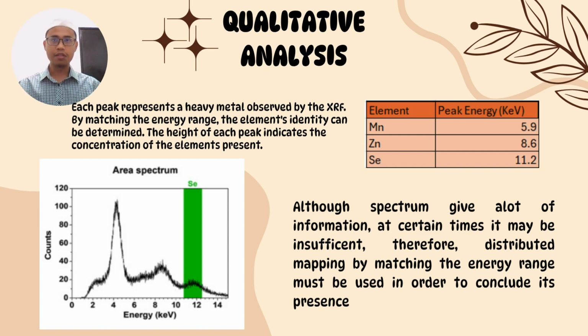Each peak represents a heavy metal observed by XRF. By matching the energy range, the element's identity can be determined. The height of each peak indicates the concentration of the element present. Although the spectrum gives a lot of information, at certain times it may be insufficient. Therefore, distribution mapping, by matching the energy range, must be used in order to conclude its presence.